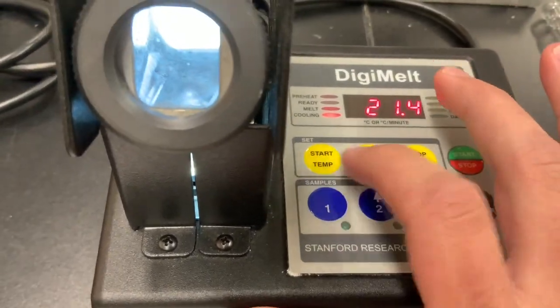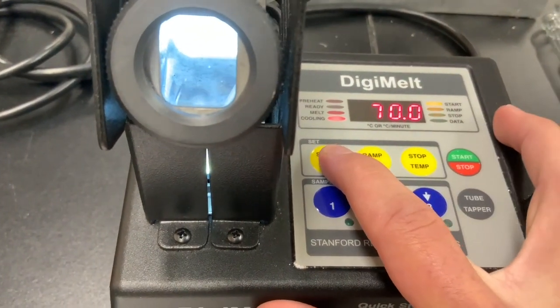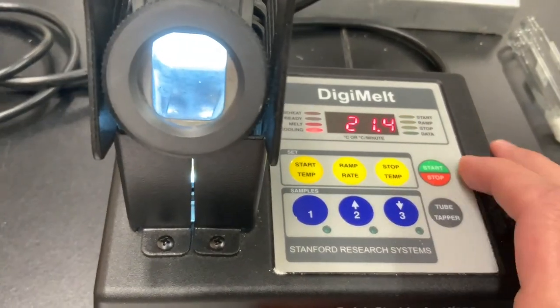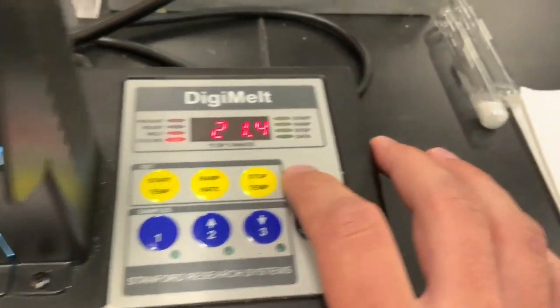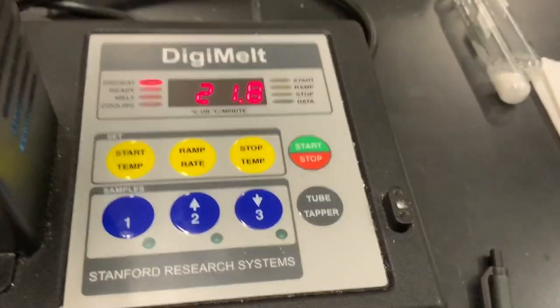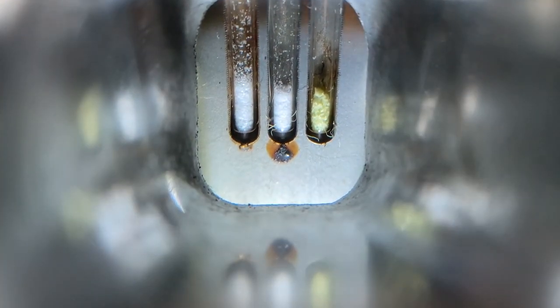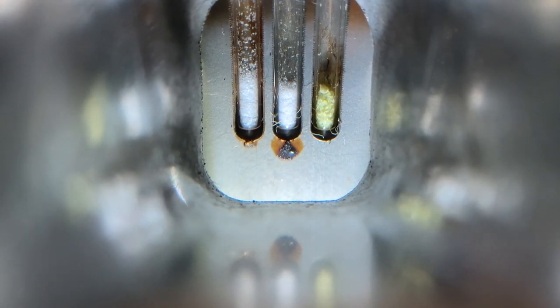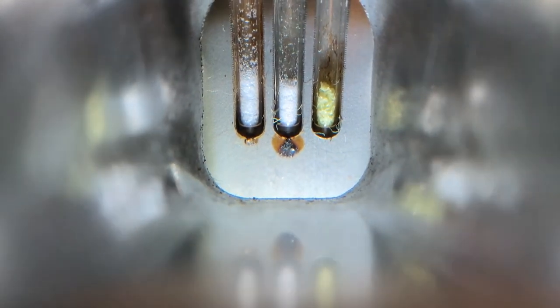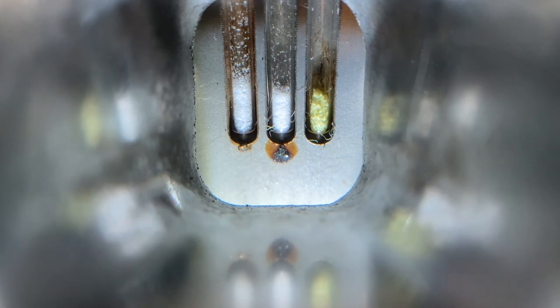To start the Digimelt, I have the start temp at 70 degrees for when it'll start slowing down, and the ramp rate at 5, and the stop temp doesn't matter as long as it's over the highest one. So it's not warming up yet, but when you click start, it'll preheat, and then I have to click start again when it's ready at the start temp. So I will tell you what the temperature is when they start to melt. And remember, we need a starting point and a stopping point. So the first sign of liquid is going to be our start temp, because they're going to melt over a range. And then once it's completely liquid, we'll have that be the stop temp.